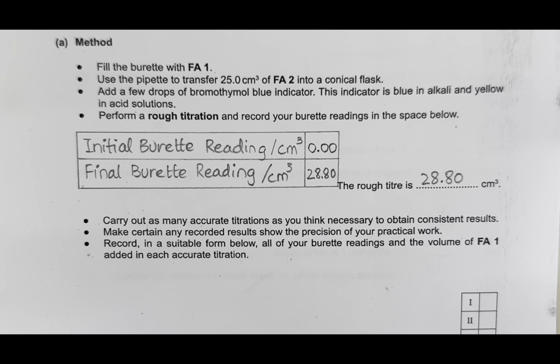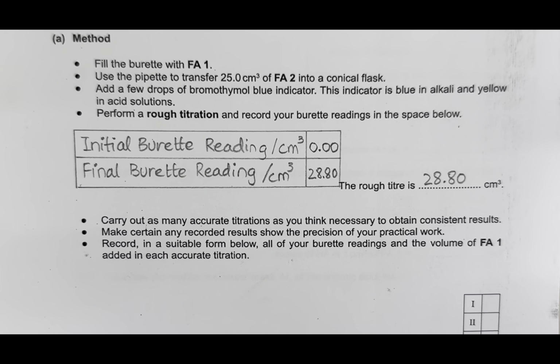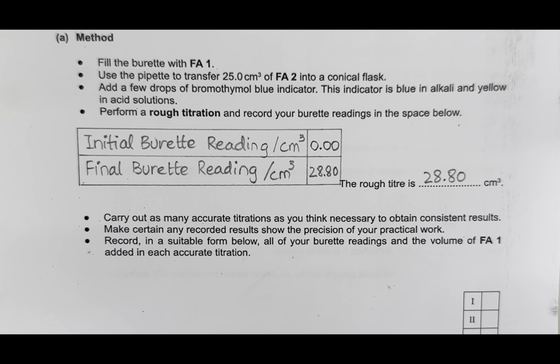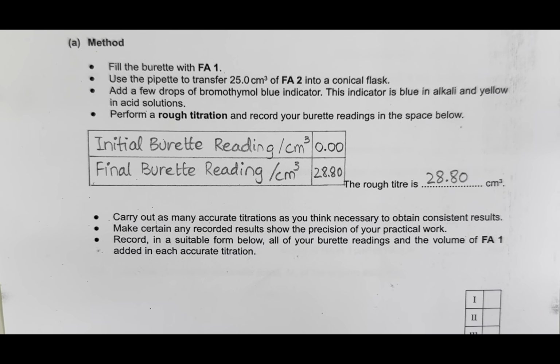The next part says carry out as many accurate titrations as you think necessary to obtain consistent results. So first of all, let us see what is consistent results.